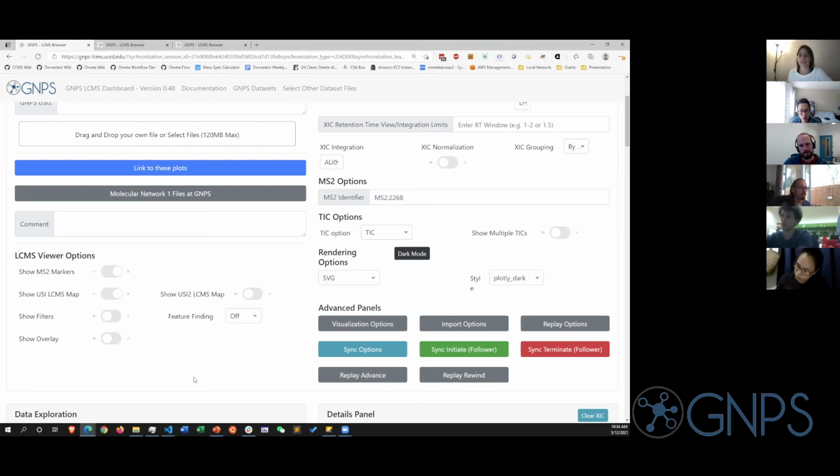With regards to OpenMS or other feature finding tools, if you would love to help out and contribute the software and the templates and the recommended set of parameters that we can change, we would love to integrate that in. One of the things that is missing is a downstream component where you can scale that up from one file to more. It's kind of a buzzkill, right?